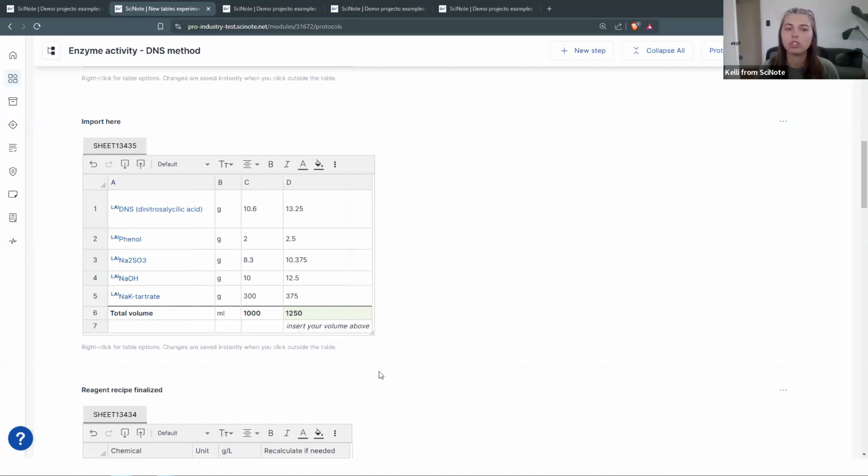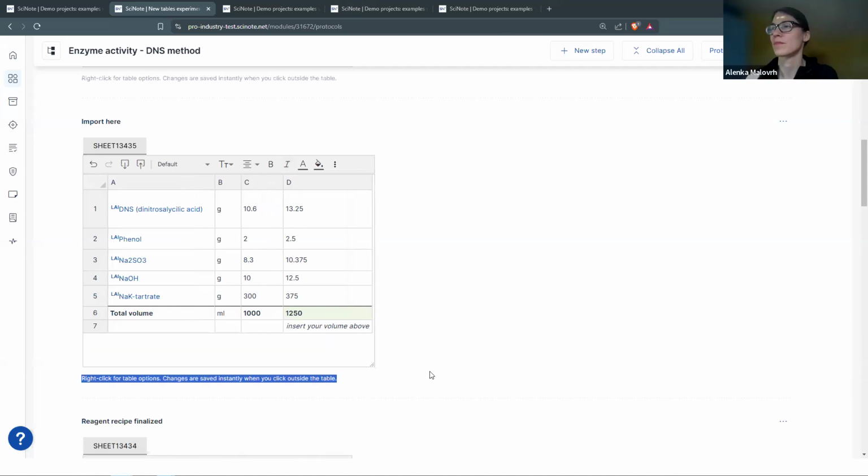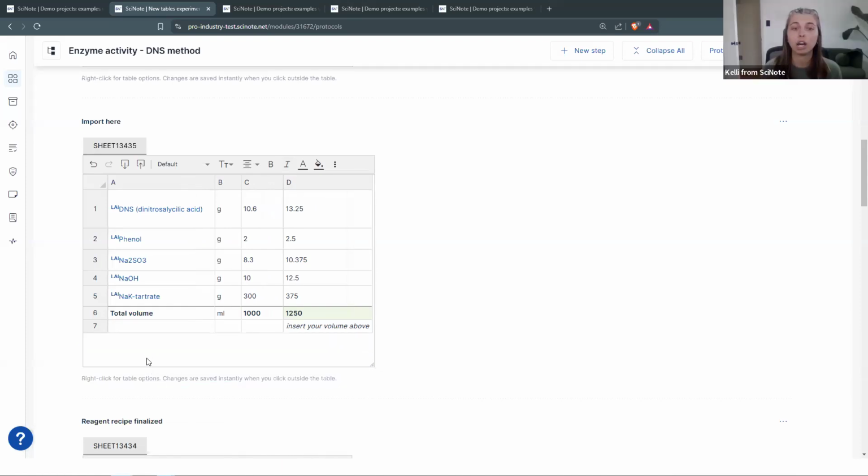If doing so, I know sometimes for me, I will have to just refresh to let the table catch up with me. And then typically when you extend it down, it will stay to about the full depth, if not just one row less. If that's not happening in your case, please let us know so that we can look at that a little bit further.